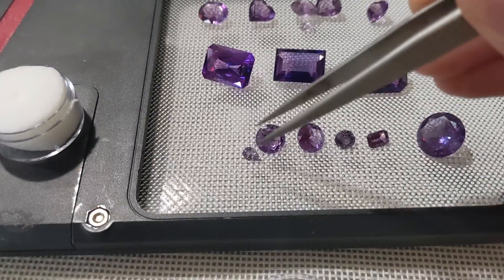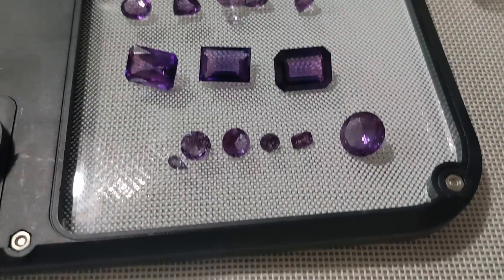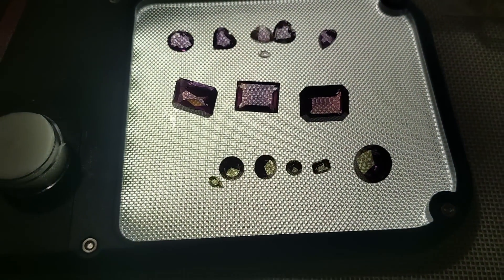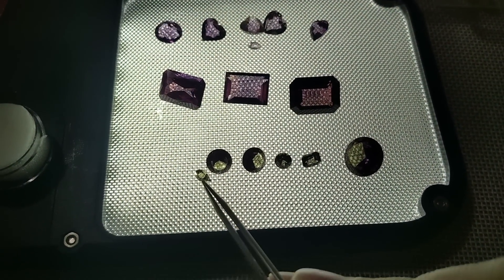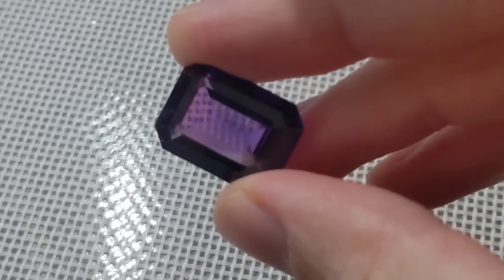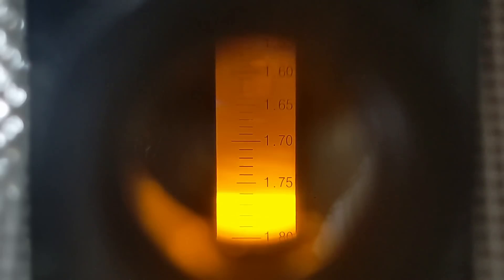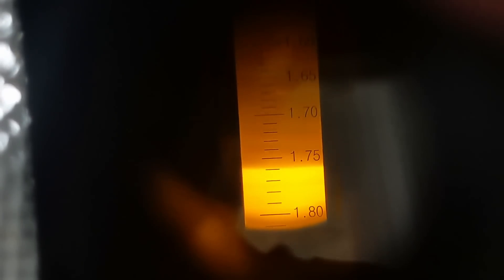A quick test was to put a known stone down — in this case a color-change synthetic sapphire that I cut — which, when backlit, turned the same green as some of the other synthetics. I figured the easiest stones to test would be the bigger ones, so we'll start with this purple rectangle. It reads close to 1.76 and has birefringence. Rotating the polarizer shows the difference in the refractive index, in this case less than 0.01, which is in line with sapphire. In the case of the purple hearts, zooming in we see it hovering around 1.54, which is a good match for quartz.